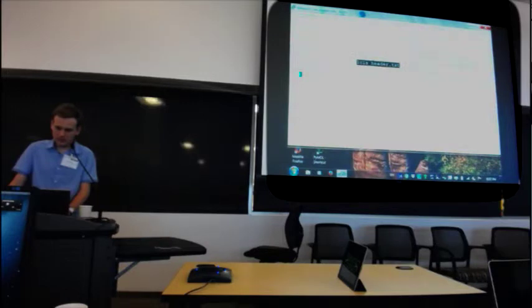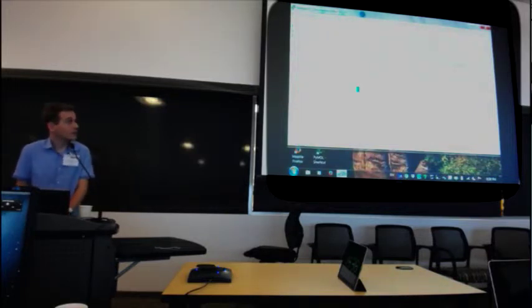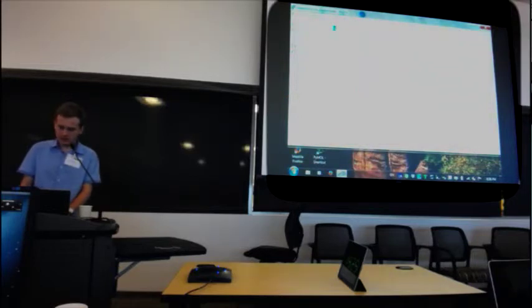Now, the other file to edit is this one. We have to change the queue name. So we are going to edit the lcls_header.txt. And similarly to what we did before, we are going to change the queue name from this. And we are changing this line to PS ANA CSQ.